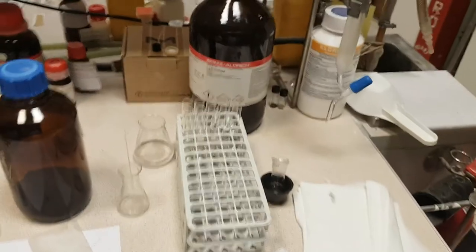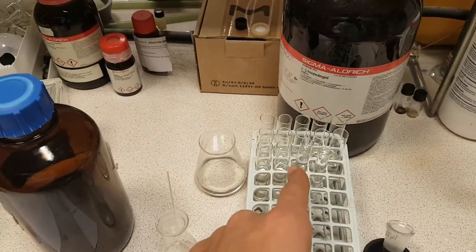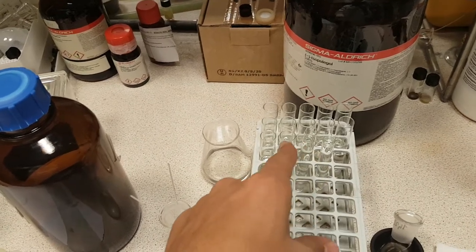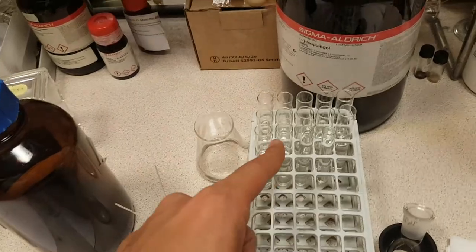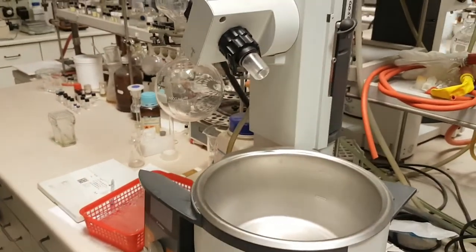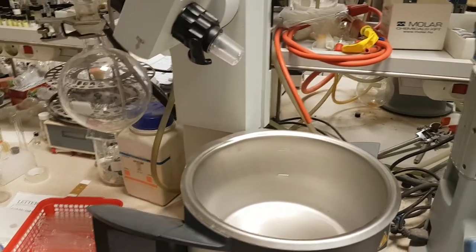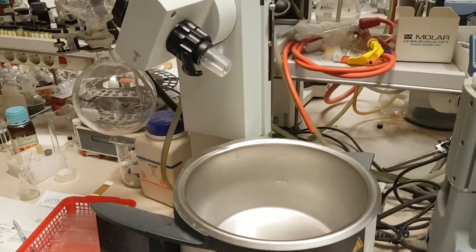So we will recover the tubes that present the strong spots from our tube rack, and then we will evaporate the solvent and recover our molecule, and of course do some structure elucidation using NMR.